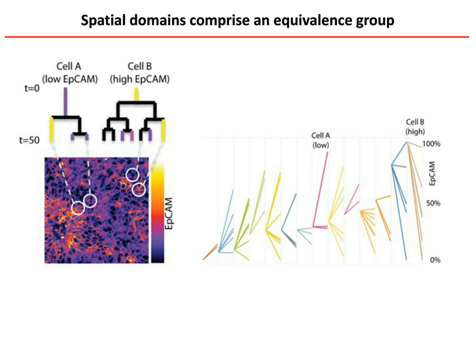In the schematic on the top left, cell A, this is an actual, precise lineage of one cell. It divides twice to give rise to 3 daughters. One of them is at the edge and is shown in yellow, so it's a kind of high EPCAM cell, and there are 2 others that divide late in this time course, and they're both low.